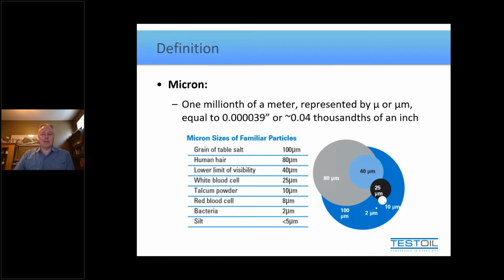So the unaided eye, basically a dark particle on a white surface, could you even see it? Could you tell that it's there? Where I'd like to focus your attention, though, is on the two examples of blood cells, white blood cells and red blood cells. Look at those two measurements, 25 microns for white and 8 for red.